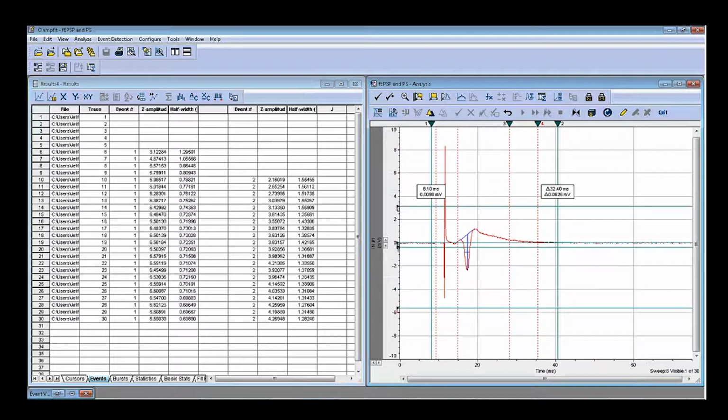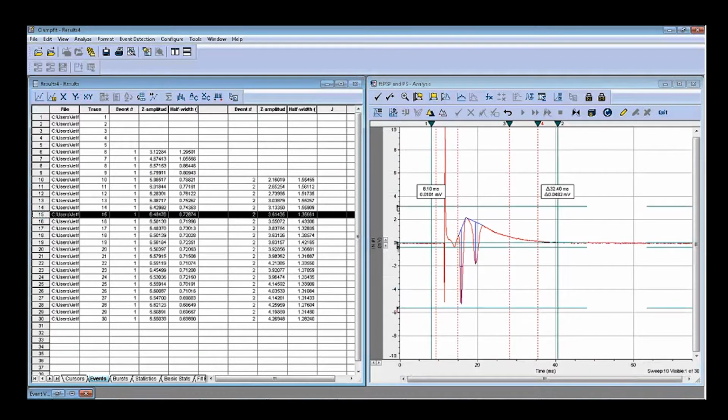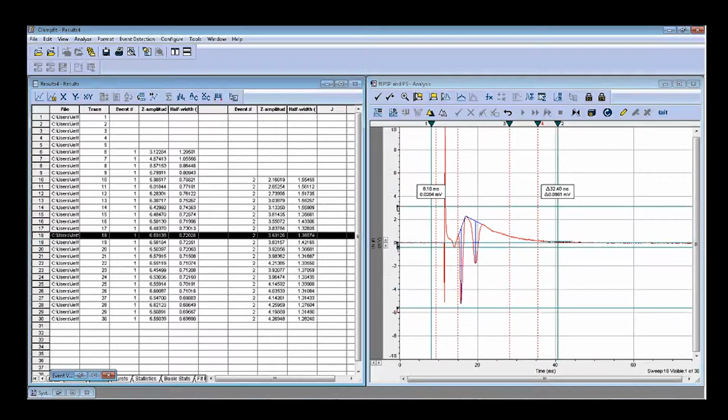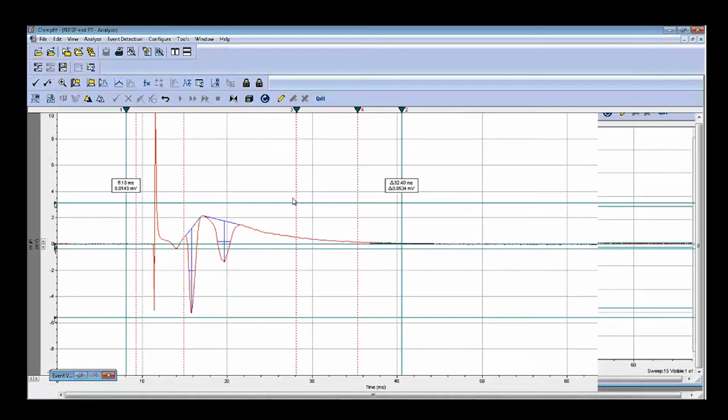Now we check this one, go to 10. Now you can see we have 2 spikes here. Right, you can see here. Right, you can click this one. Now, this one. Okay, anyway, you can see here, you can see the sweep. You can check this number, right? So that is one way that I show you how to fine tune. Now I can still show you how we can fine tune, right?